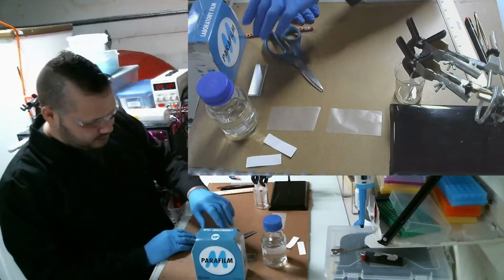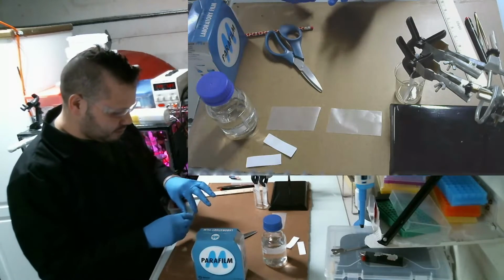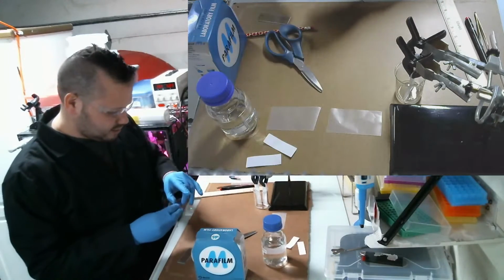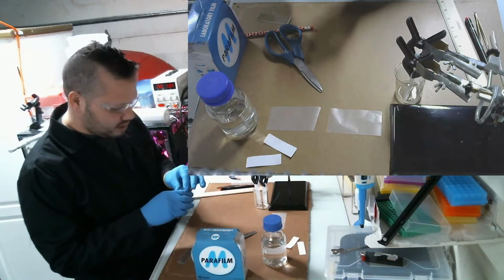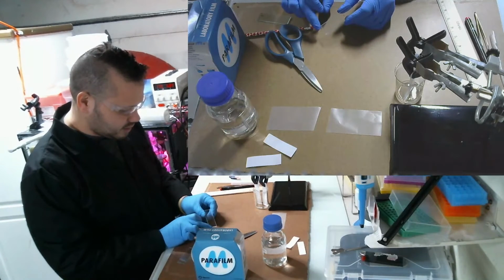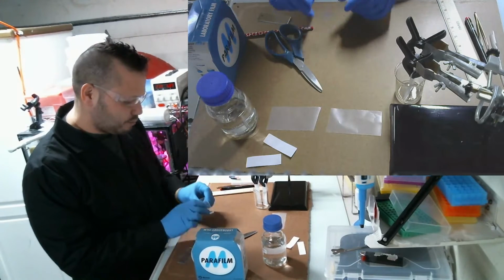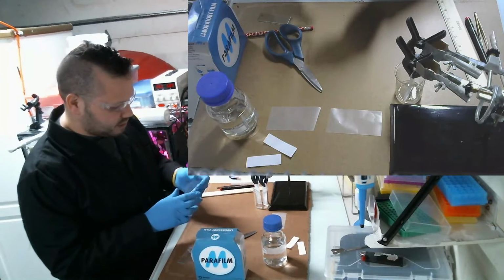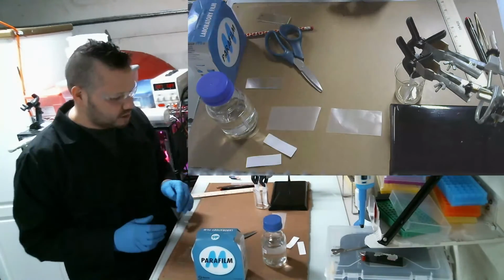And now we wait. But what I will be doing is taking the chromatography paper and sandwiching it between two microscope slides, with just a little bit of it hanging off. And then the idea, once it's dry, is that I'll put a sample of indole acetic acid on the paper and then soak some acetone up through it to see if it draws it up and causes a positive result. Also, I want to see if there's a way I can quantify how much there is.